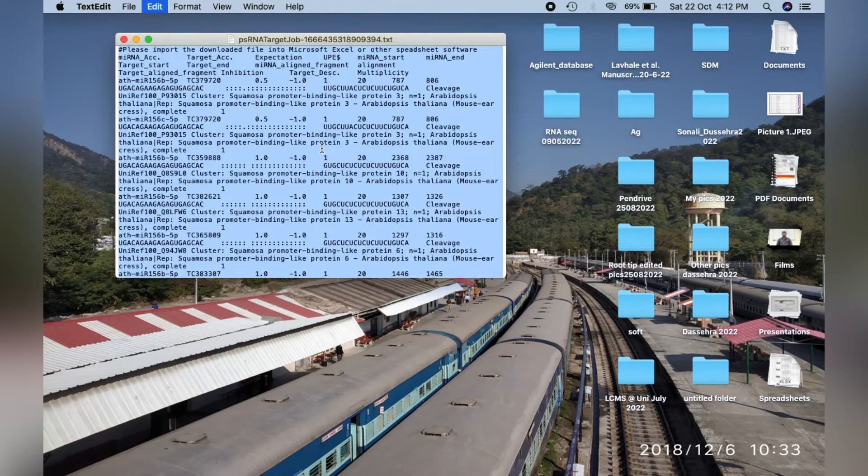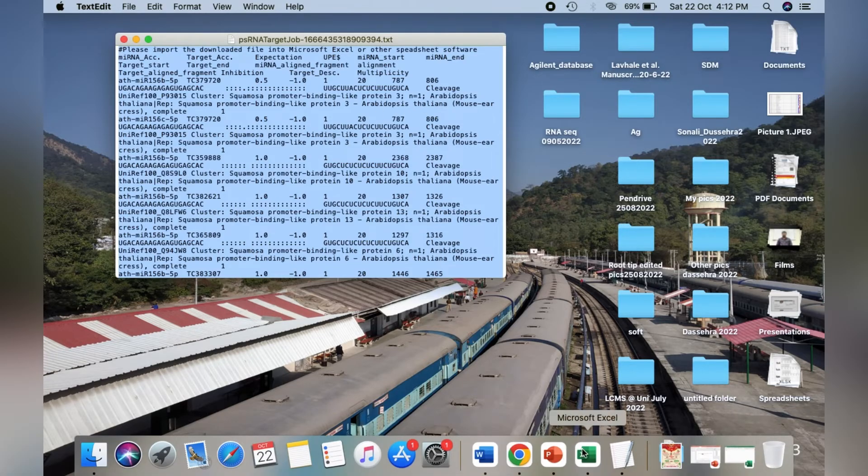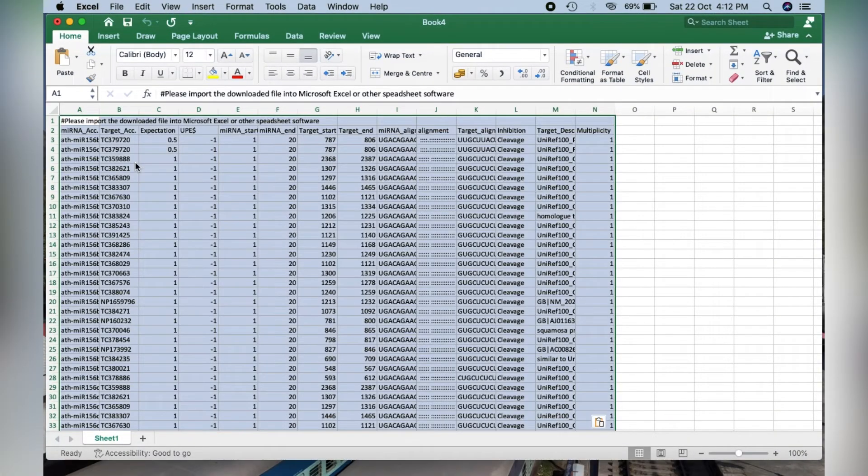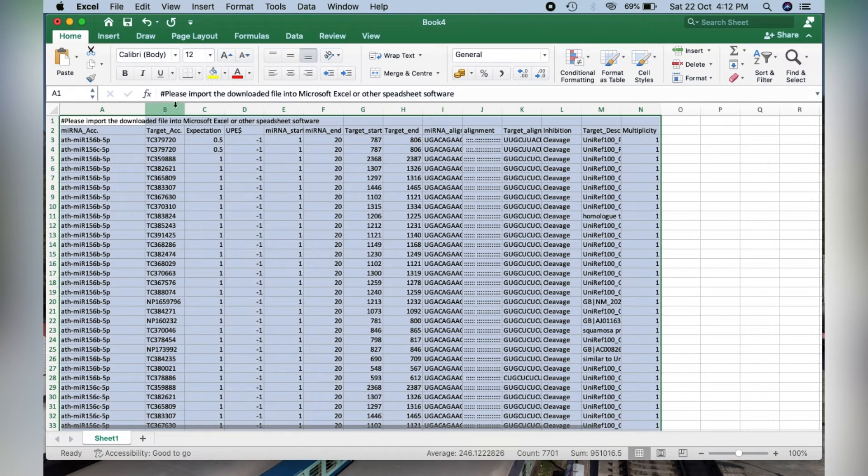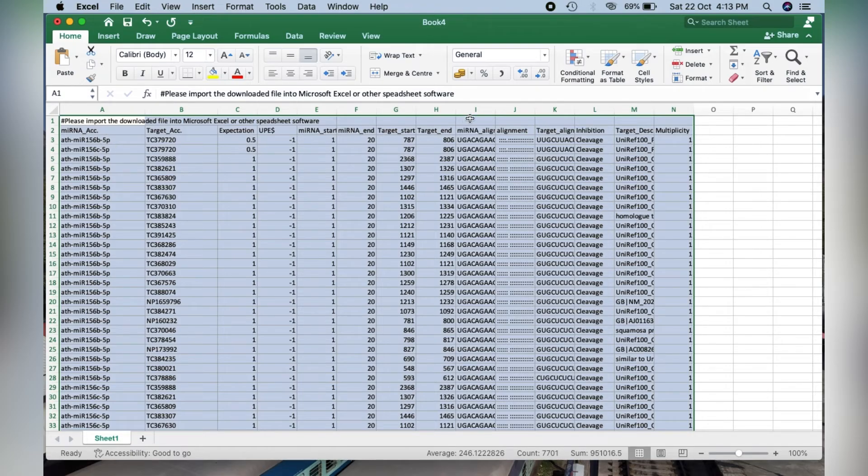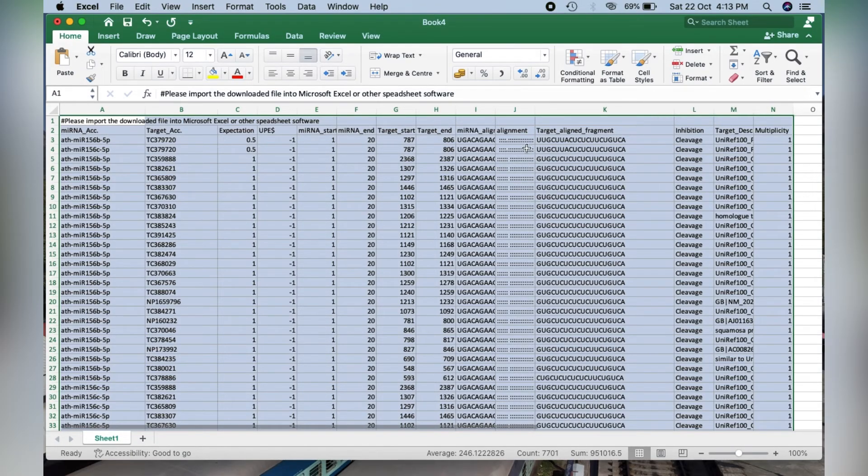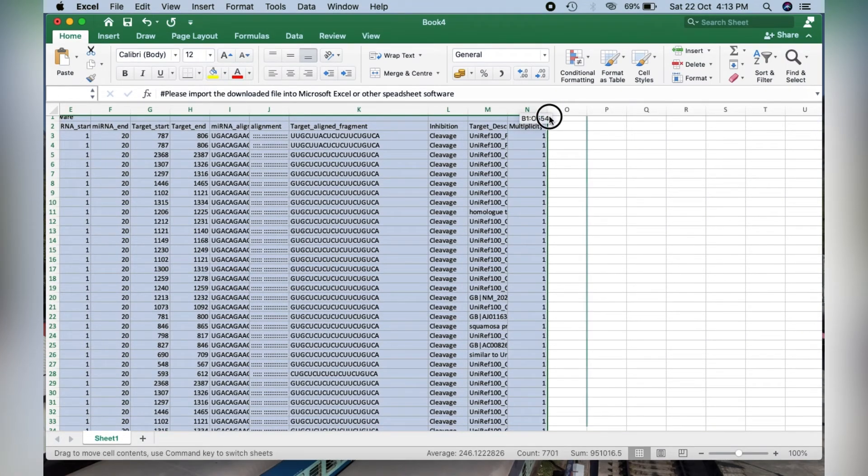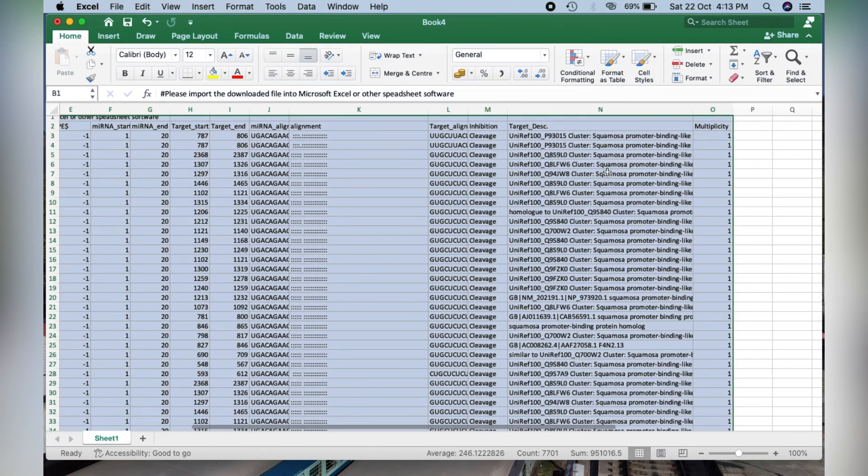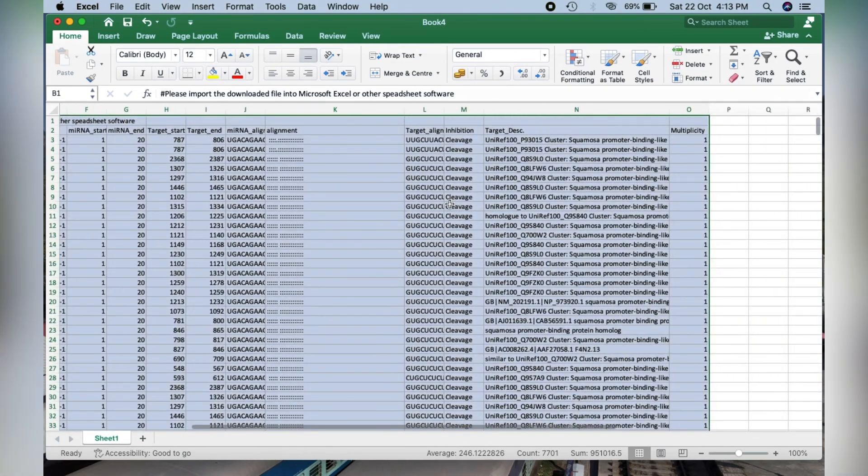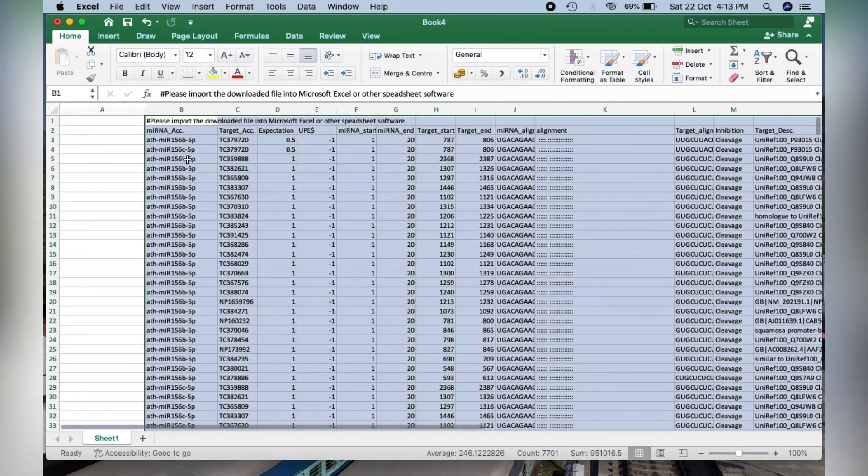We can select this data from the text file and paste it in the Excel sheet. As you can see here, we have the results of our analysis. These are the microRNA accession numbers, this shows the target alignment, and this column shows the target description. So in this way, we can predict the targets of our selected microRNAs.